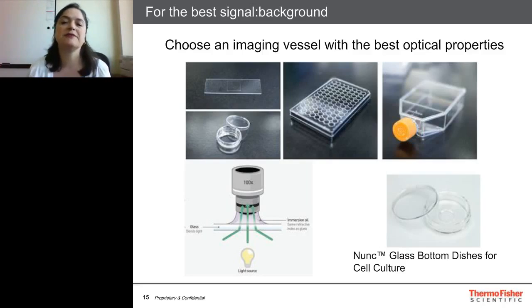A lot of times, if you look at that orange lidded flask, many times you're checking cells in the actual tissue culture vessel they're commonly grown in. That plastic is fine for growing cells, it's great, and it will work for quick checks, but if you want a really high quality image, you're going to have to culture your cells on glass.